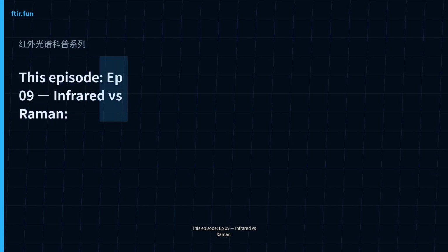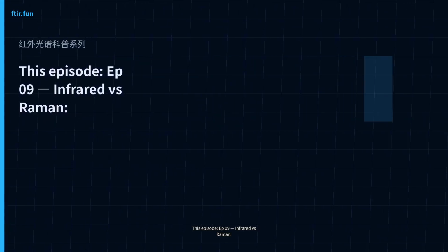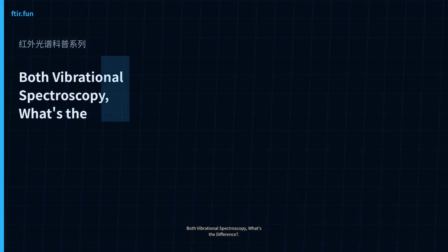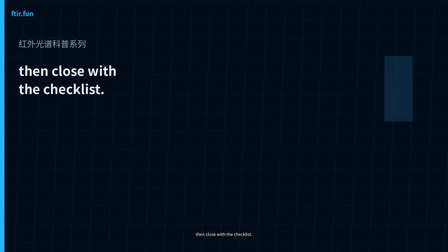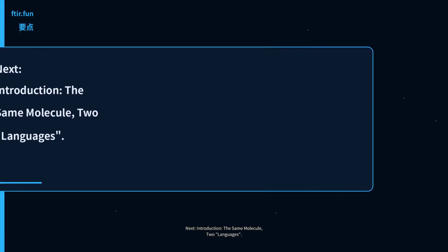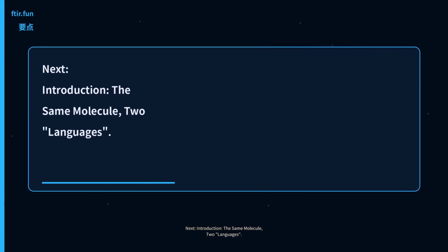This episode, Ep09: Infrared vs Raman. Both are vibrational spectroscopy. What's the difference? Then close with the checklist. Next, introduction. The same molecule, two languages.